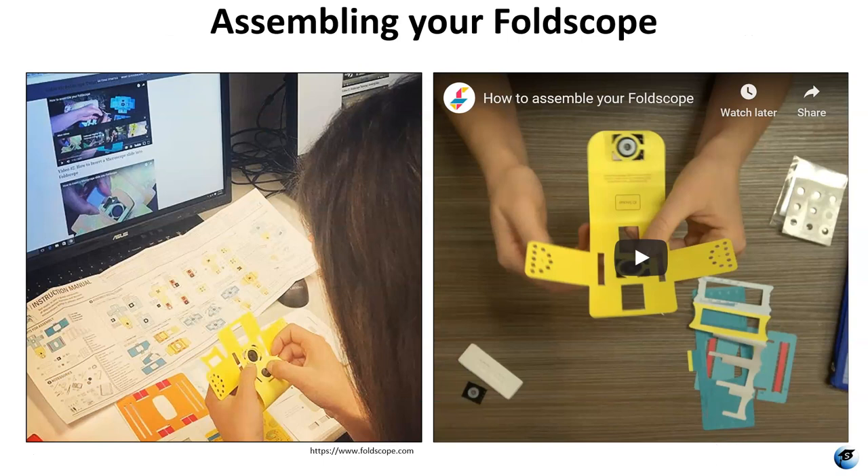The Foldscope was inspired by origami. It is really important that you follow the instructions very carefully when you are folding and assembling the parts. Your kit comes with written instructions. I recommend having the written instructions and the videos close by when you are assembling your Foldscope and making sure you're doing it step by step.